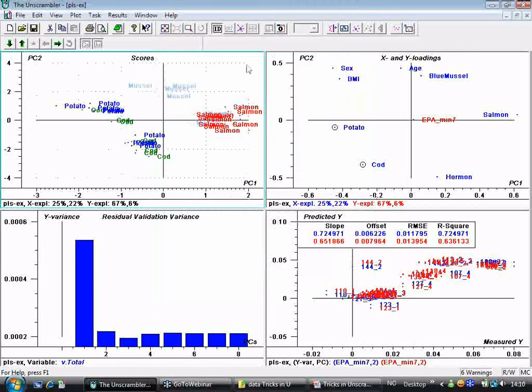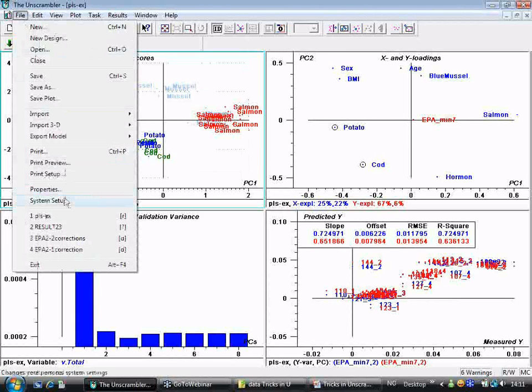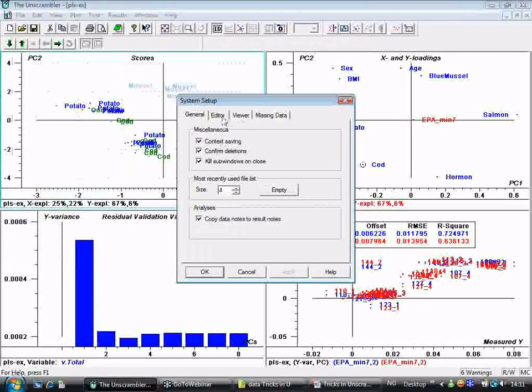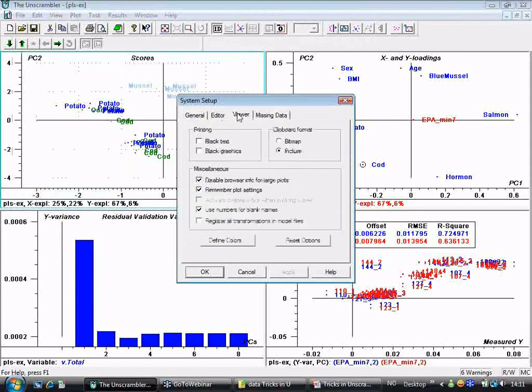As you can see, I've added a grid in the background. Now, to be able to make changes in Excel or PowerPoint, I need to configure something in system setup under the viewer. When doing a copy — Ctrl-C — of one of the pictures, I have two different formats: bitmap, which will be fixed and cannot be changed in Excel, or picture, which allows me to modify everything.